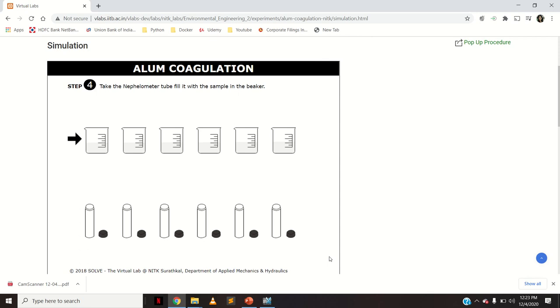After the flocs have settled, the upper layer of water will be clearer. However, you cannot visually determine how much the turbidity has reduced. Before performing this experiment you should know the initial turbidity of the water sample. In all 6 beakers it is the same water sample — only the alum dosage changes. After the experiment, find the turbidity readings of all 6 water samples.